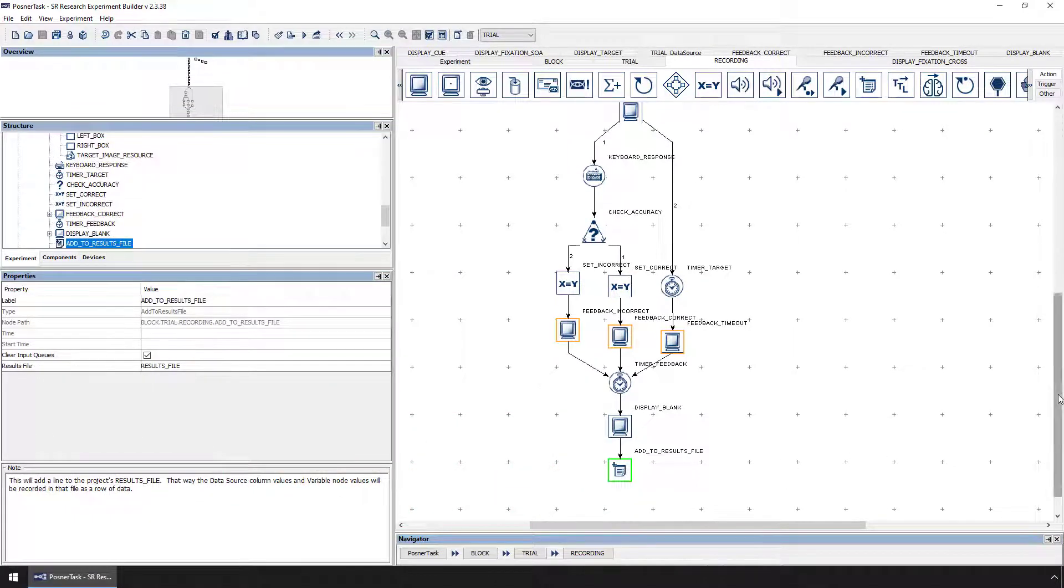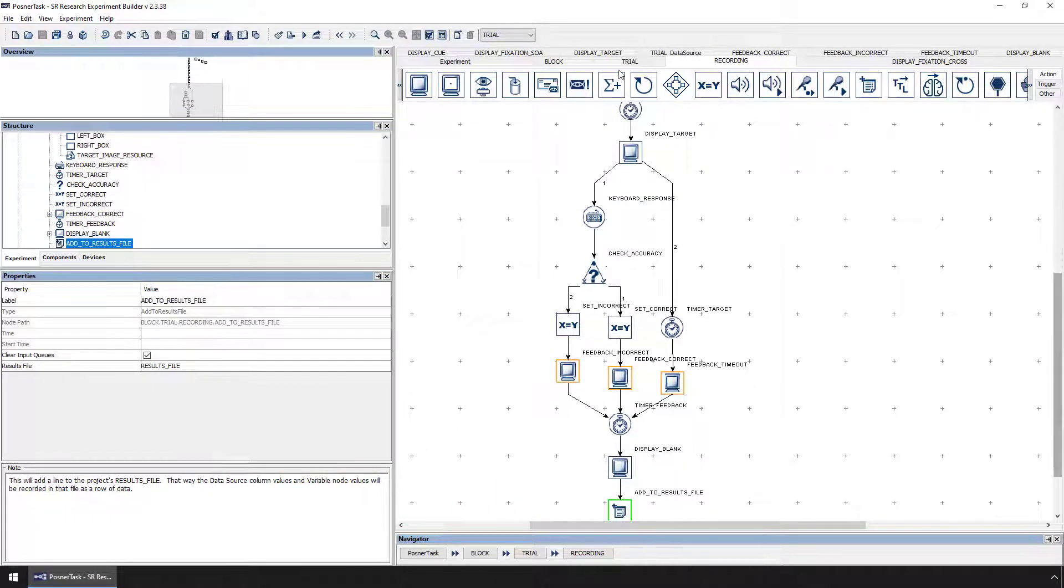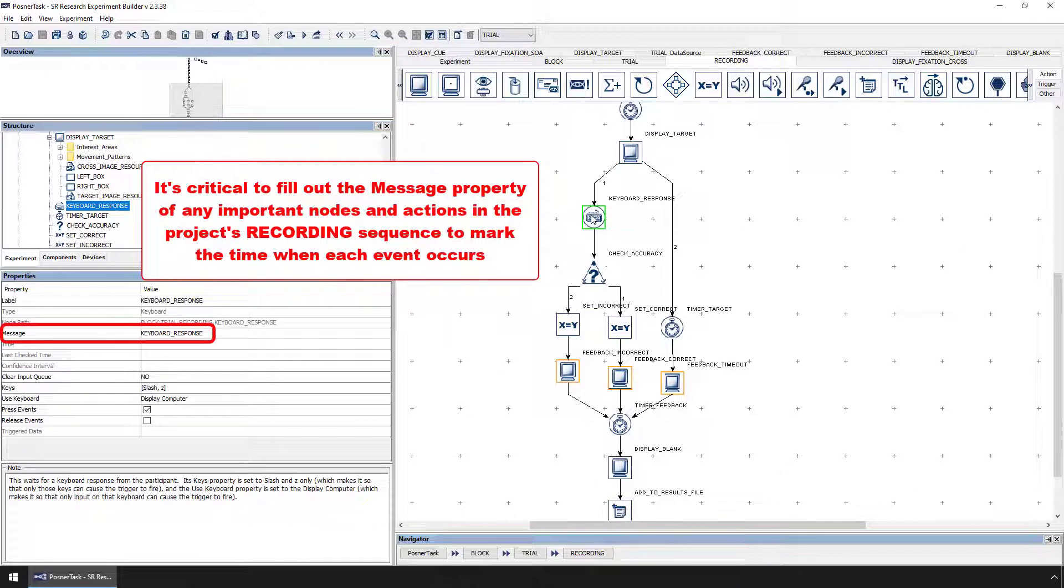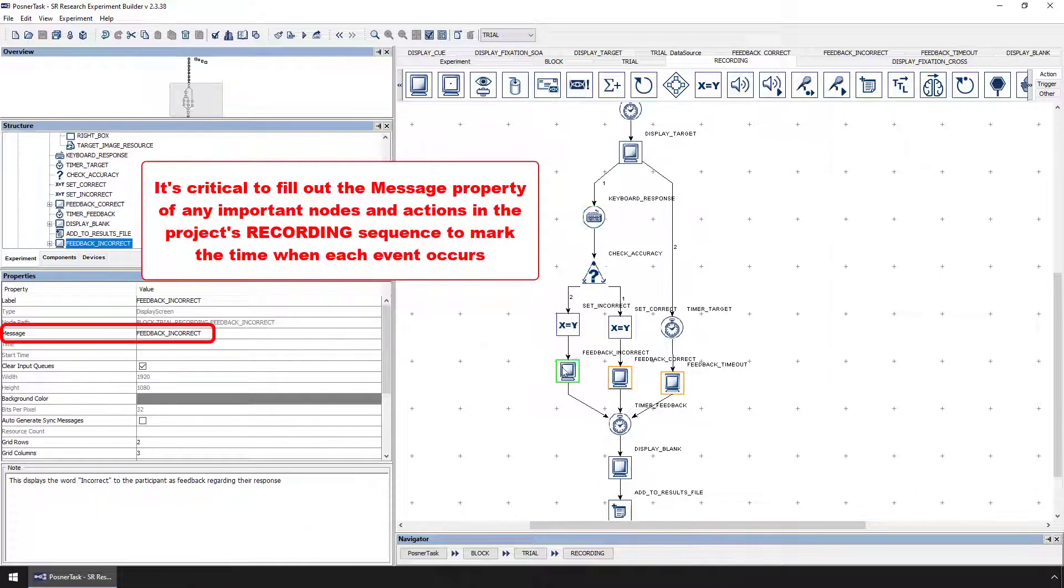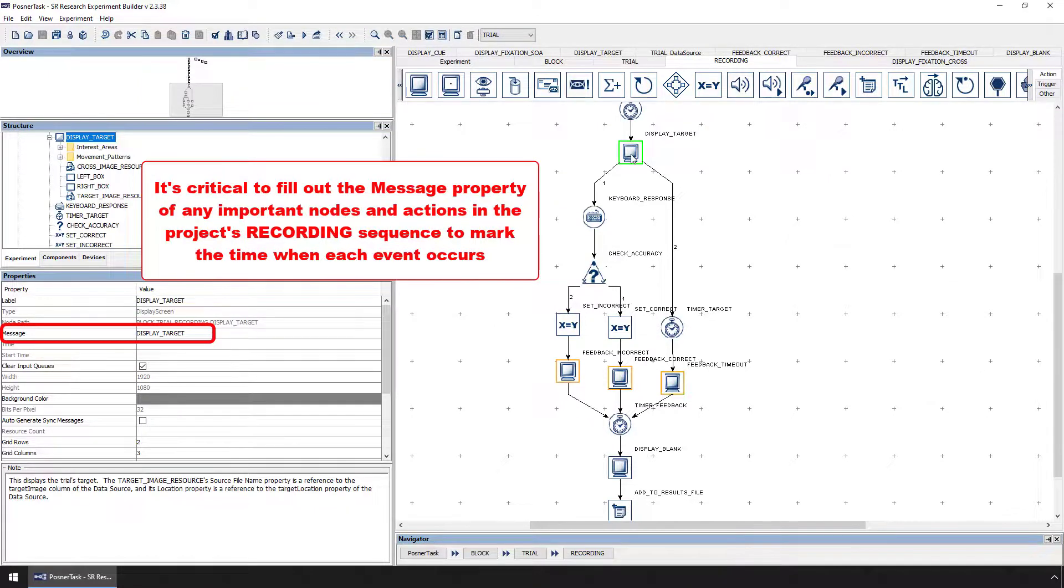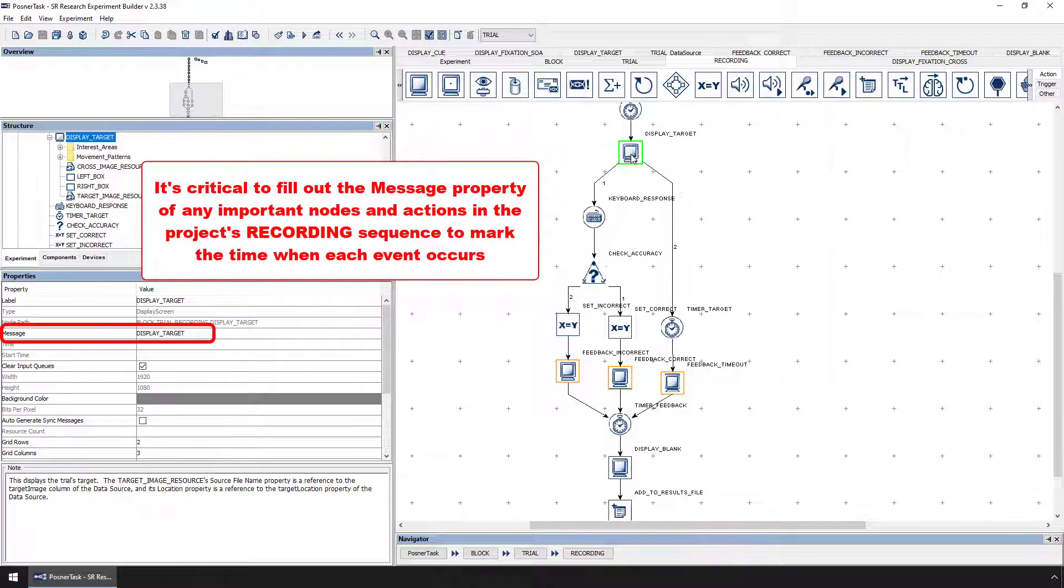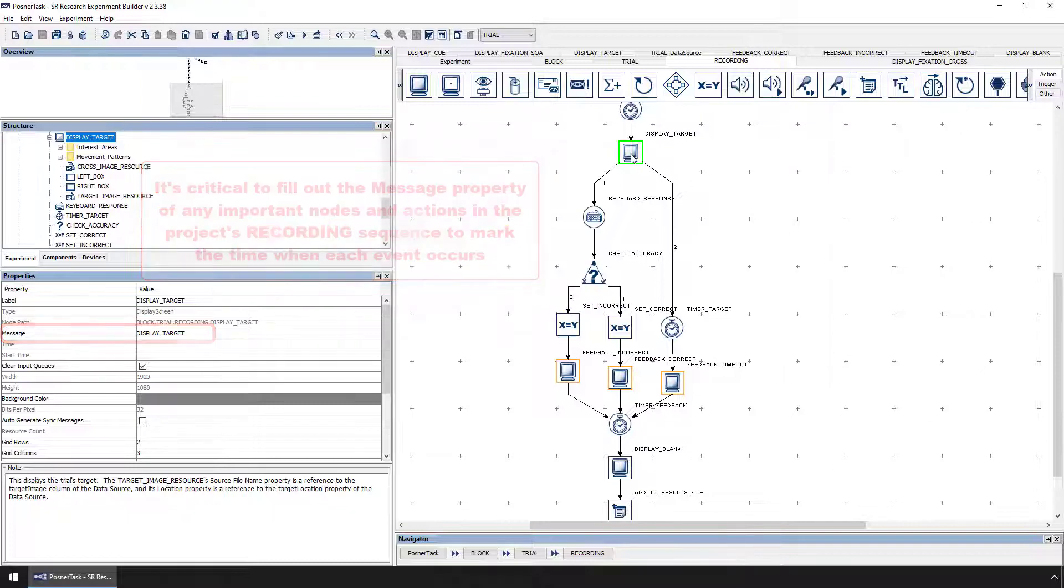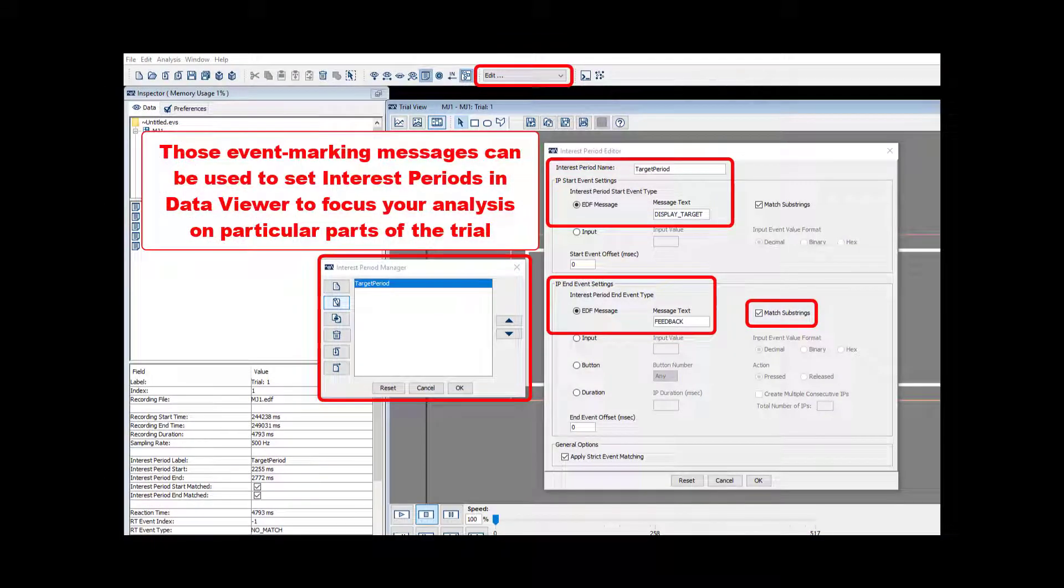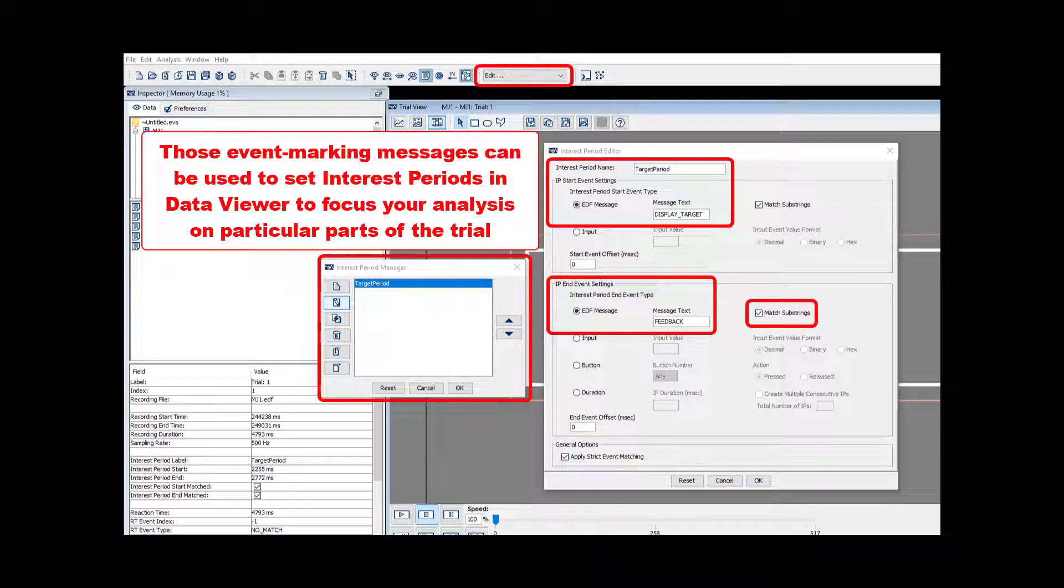Please note, it is important to fill out the message property of all the actions and triggers in the project's recording sequence. When a node is executed, an event marker consisting of the text of the message property is sent to the iLINK data file to mark the exact time of the occurrence of that experimental event. That message can be used in setting what we call interest periods in Data Viewer to focus the data analysis on particular sections of the trial.